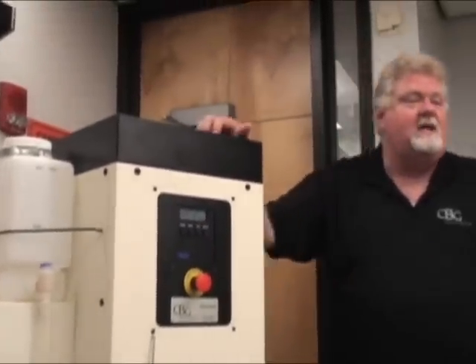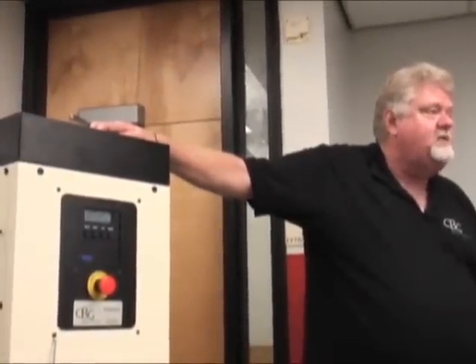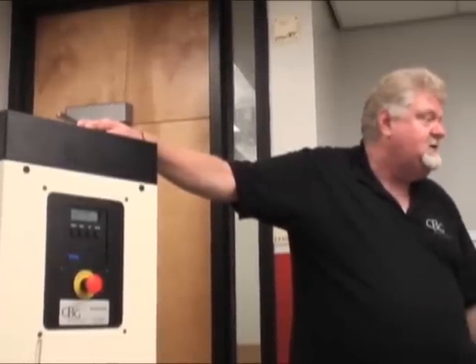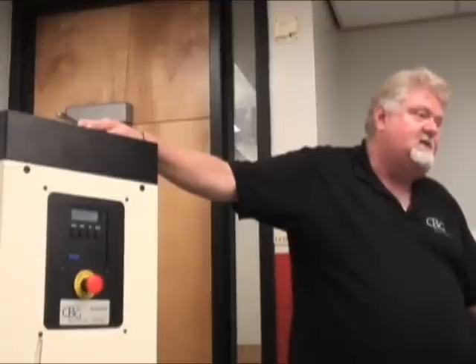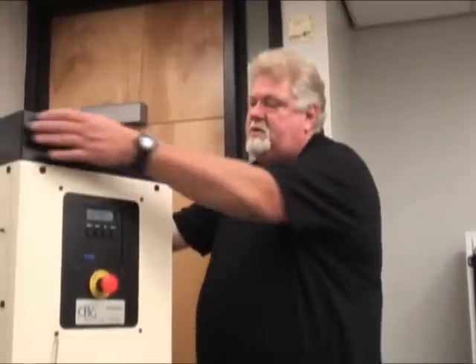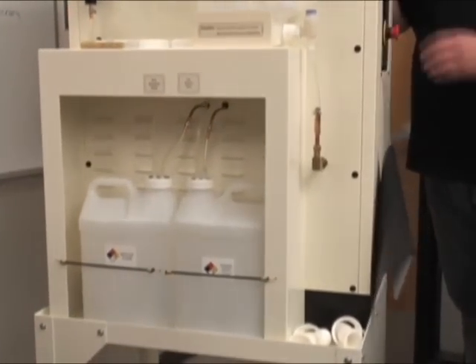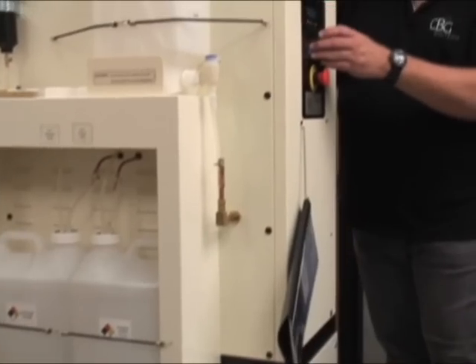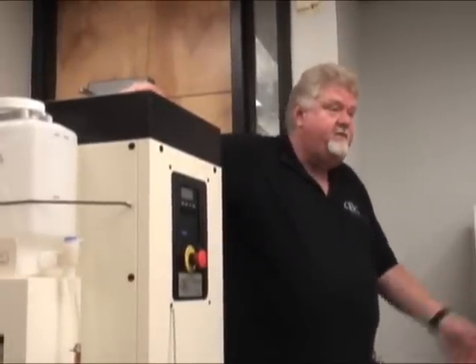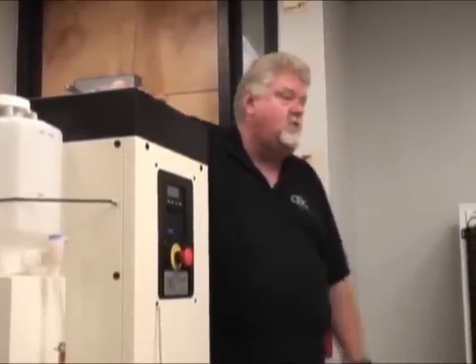Then it draws the pure xylene — 95% return in volume, 99.9% pure. No color carryovers or transfers. In many cases it's purer than your stock because it takes out all the byproducts. What you're going to get back is pure xylene, which will come back in this container here. Then it opens the waste drain and dumps whatever can't be recycled — which would be paraffin. If there's no paraffin, nothing goes in the waste and it won't hurt the machine.